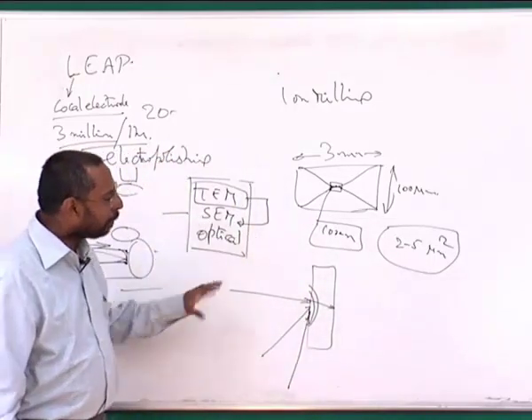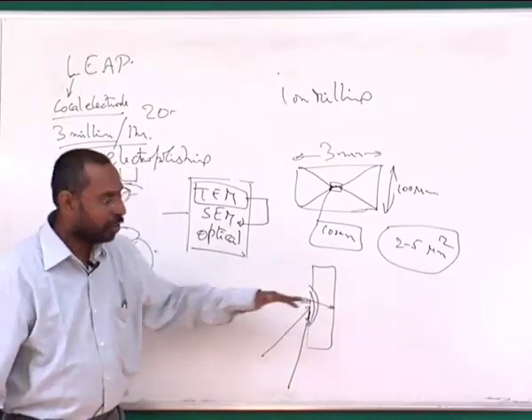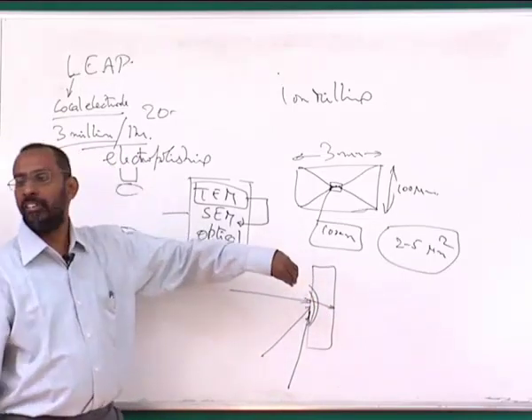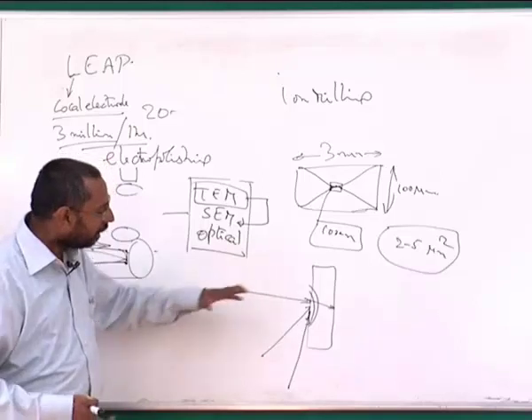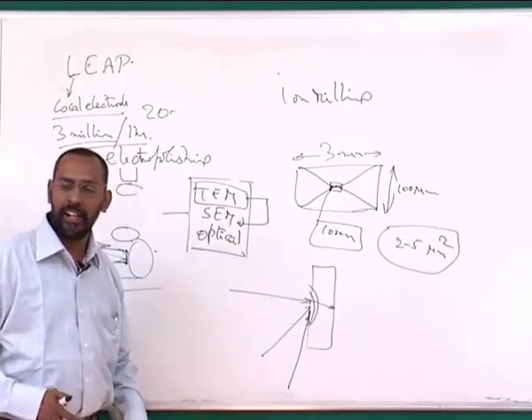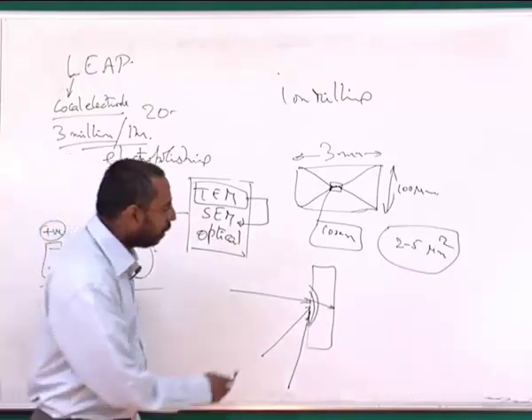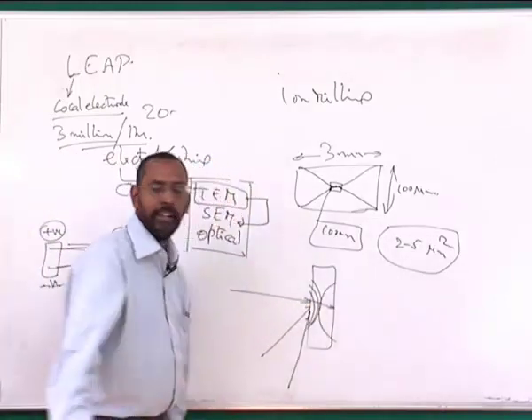So most of the time, that is why people can control this angle at which the ion beam falls. They start with a large angle, so that it initially removes the atoms, sputtering away at a much faster rate, then slowly change the angle such that it becomes like a glancing angle towards the end, so that you create a large region which is a thin region.